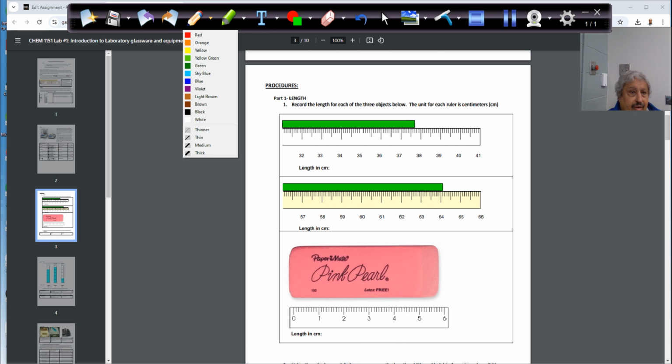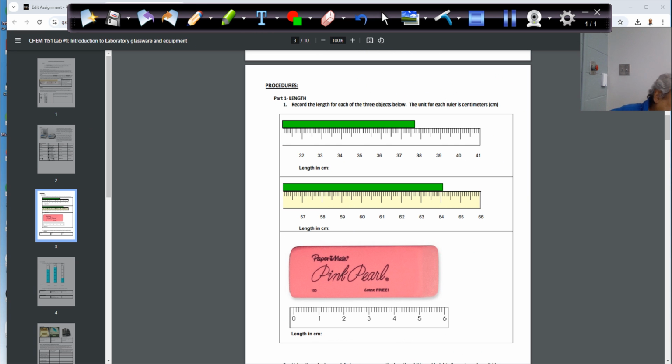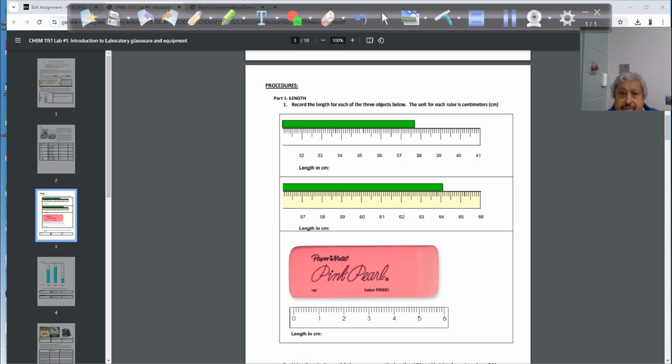So here it is, the procedure here. Let me just check my palm here. Okay, so you tell me now how much does it read in the first figure here. How much does it read for those objects, the green objects here? Can I make it bigger? Want to see it bigger? Let's make it bigger here.